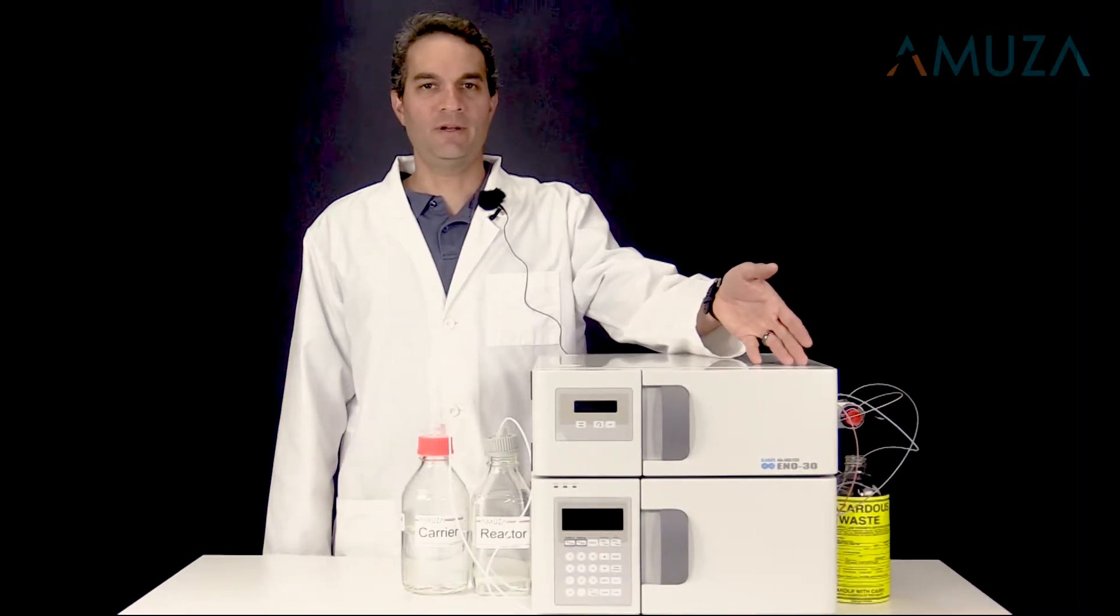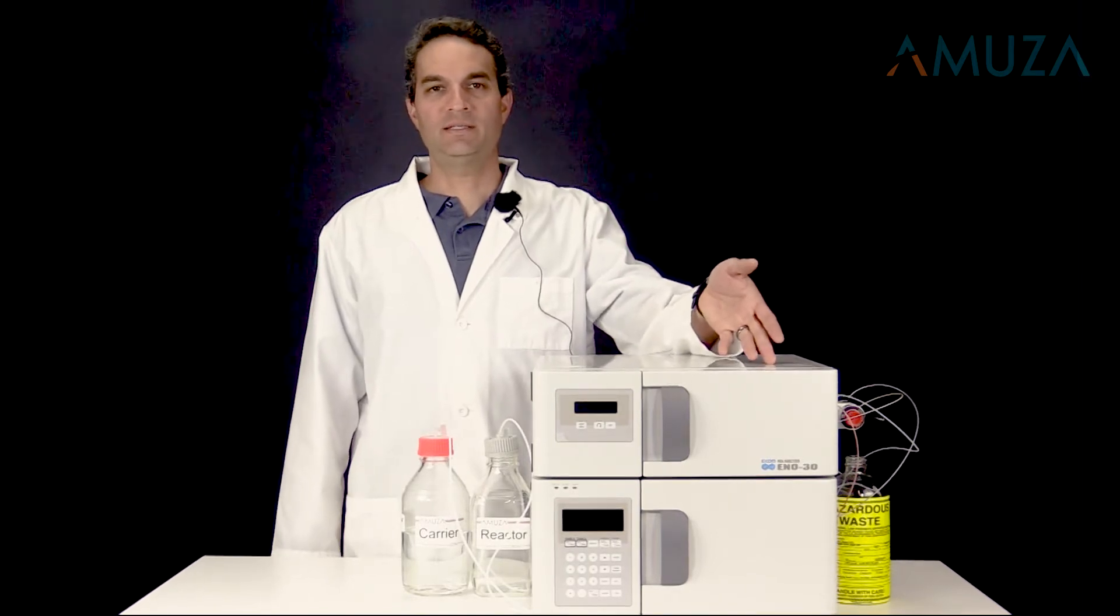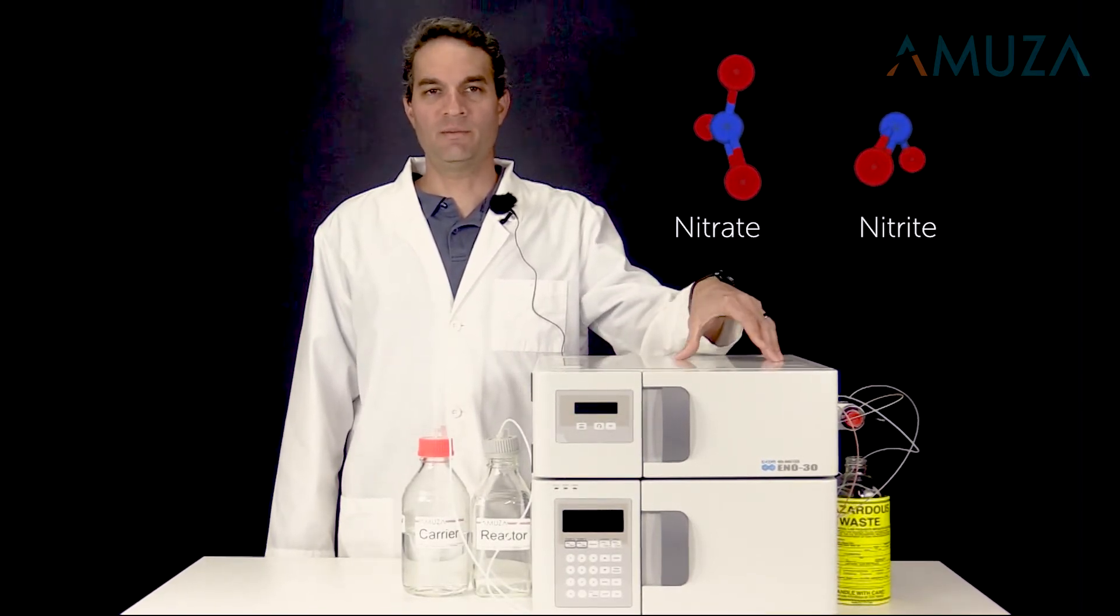Hi, I'm Derek and today I'm going to give you an overview of the ENO-30, which can simultaneously detect nitrate and nitrite in biological and other samples.